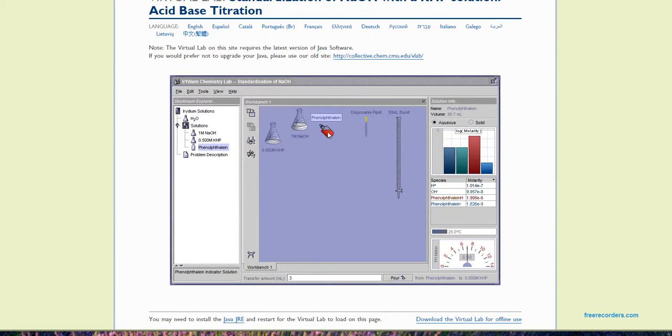Okay, I'm done with that now. You can't see it, and if you were in a lab and you added 0.3 milliliters, that's like one drop. One drop in the total volume of almost 100 milliliters. That's not very much, and you're not going to see a color. So that is step number 3, step number 4, step number 5, and step number 6.